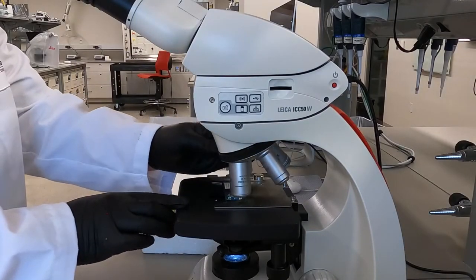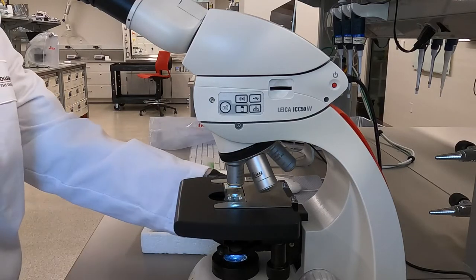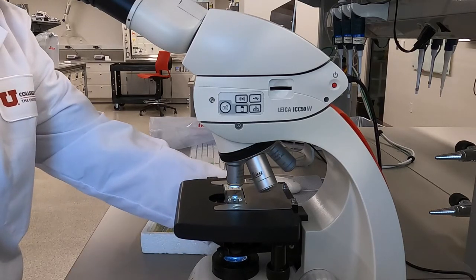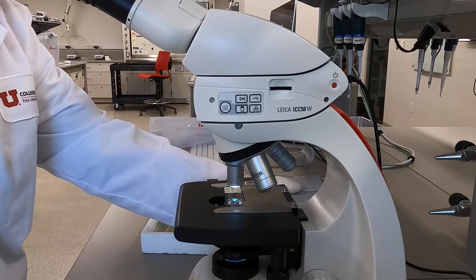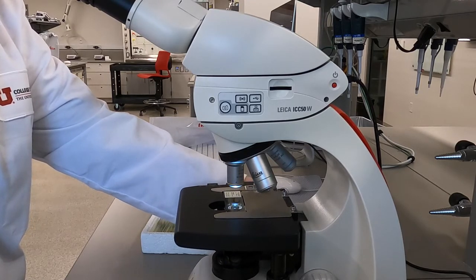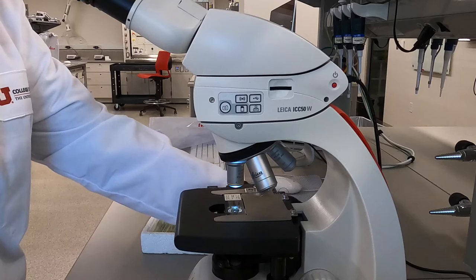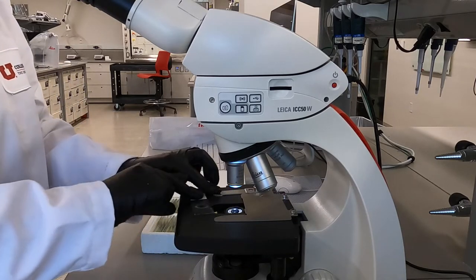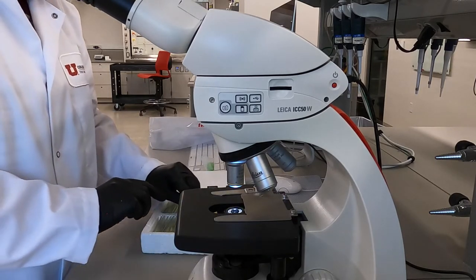If you need to change slides, use the coarse adjustment knob to lower the stage all the way. Switch to the 10x objective, or your microscope's lowest powered objective lens, and remove the slide. At this point, restart the process described for finding and focusing on your sample.